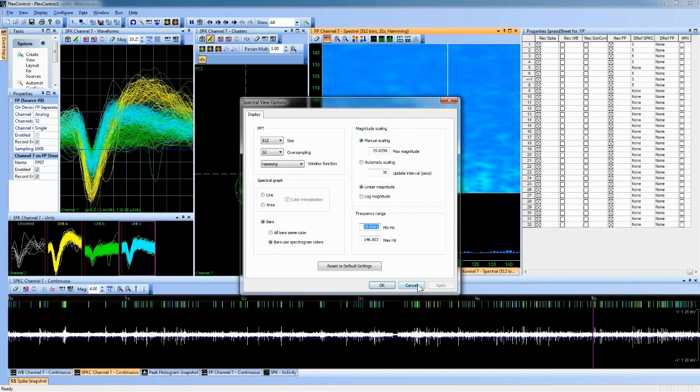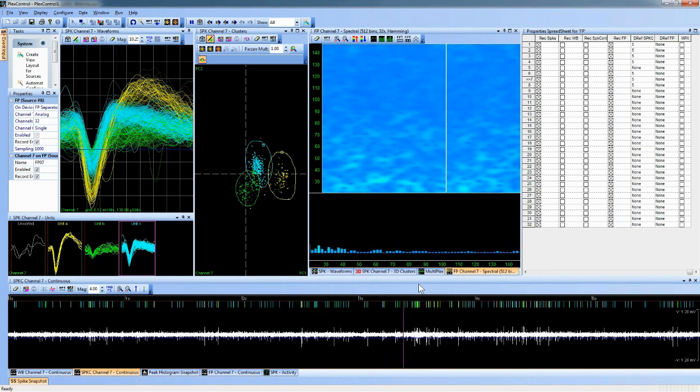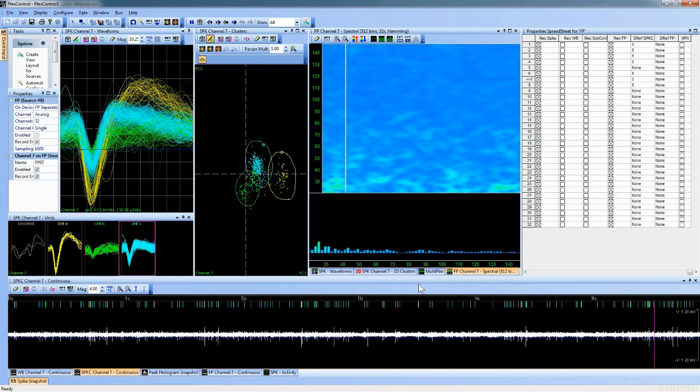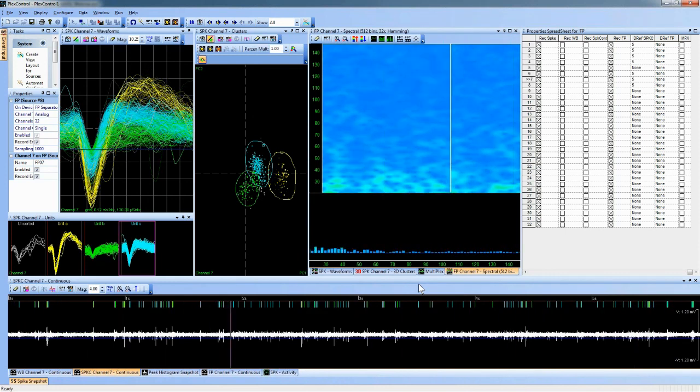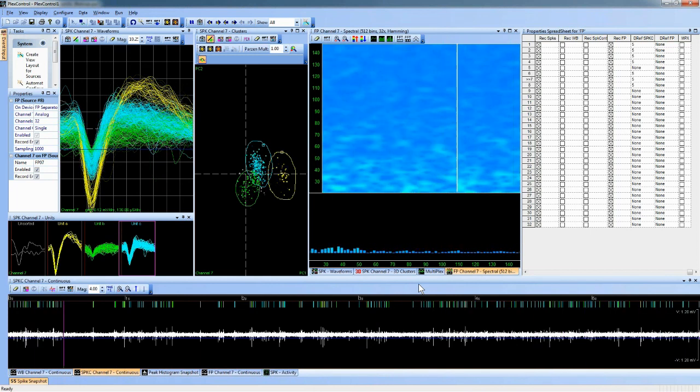That's fabulous. It's a great answer. Very good. Okay, last question. Kayla has asked, can you alter your referencing while recording? For example, if you notice that a unit is being reflected in every channel.